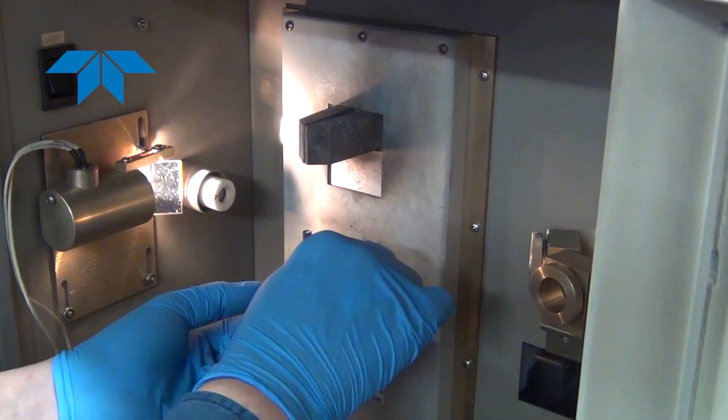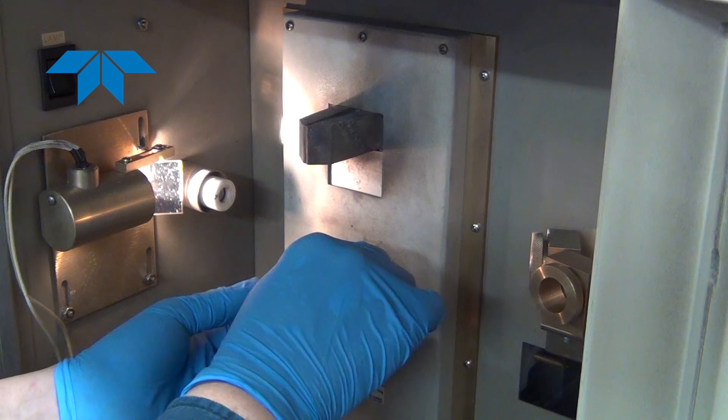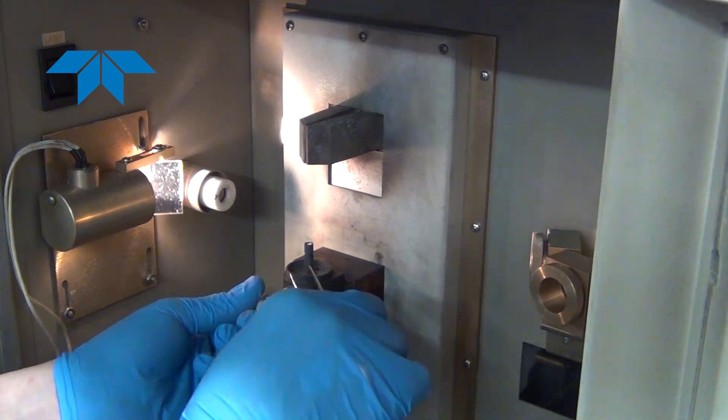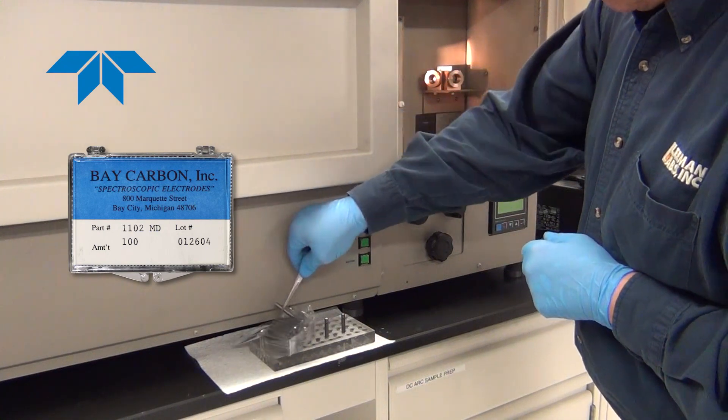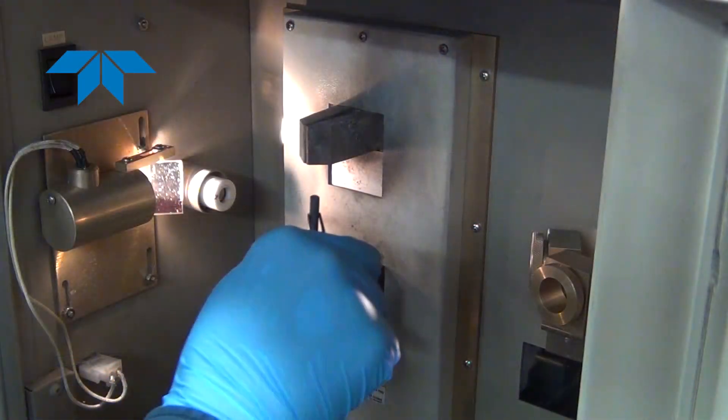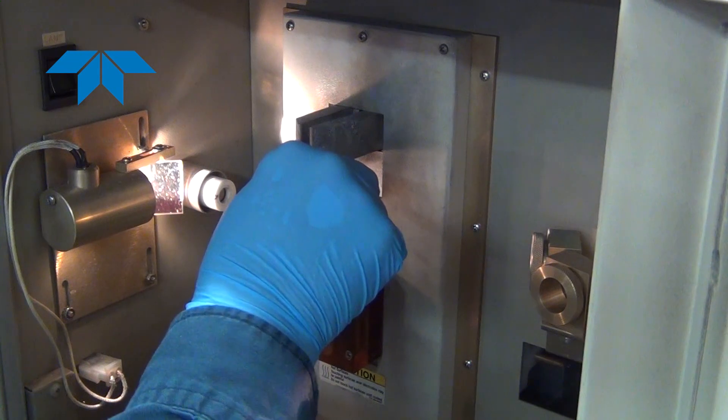Using tweezers, the electrode is placed into the bottom holder. The position in the holder is automatically set. Once the sample electrode is in place, the counter electrode is placed in the upper jaws. The jaws are opened using the bottom knob on the front of the instrument.